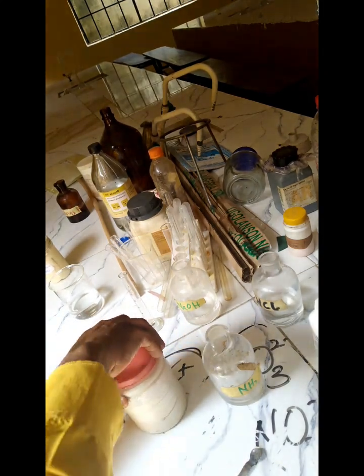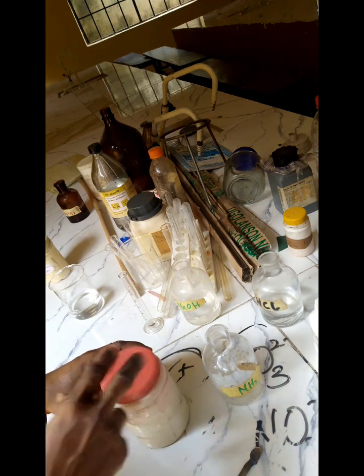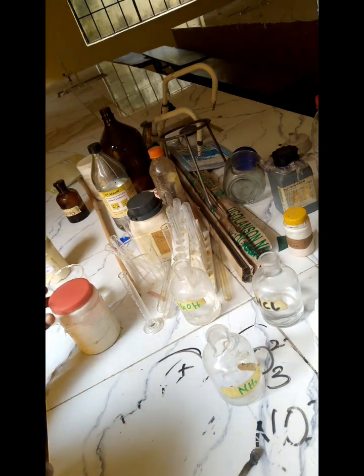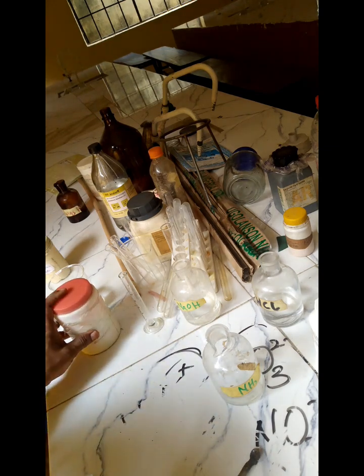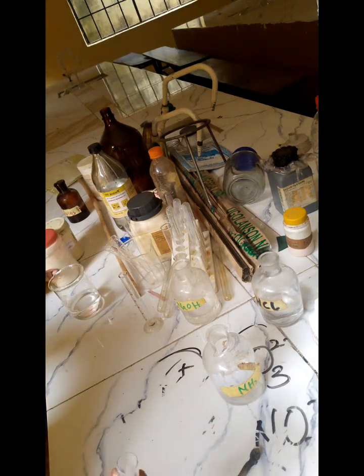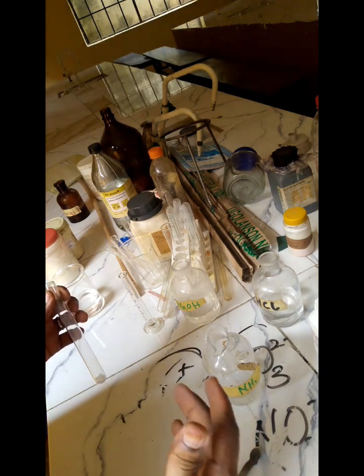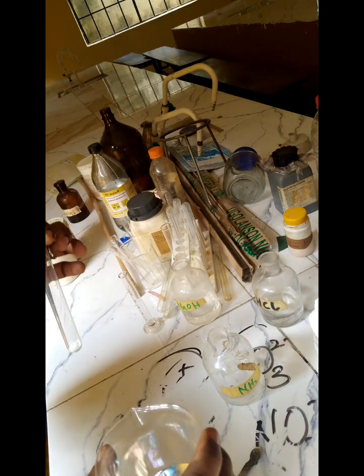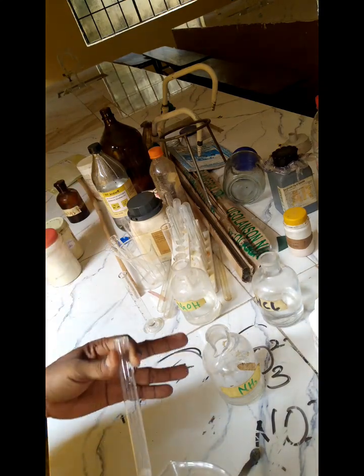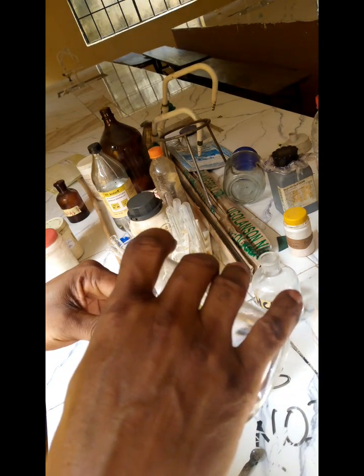So what are we adding? We'll be confirming it. We'll make a solution of it, add barium chloride to it, followed by HCl. It should form a precipitate with barium chloride and dissolve with HCl. So let's add distilled water to it.